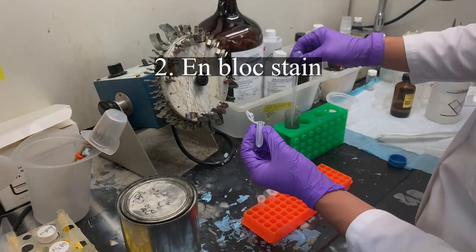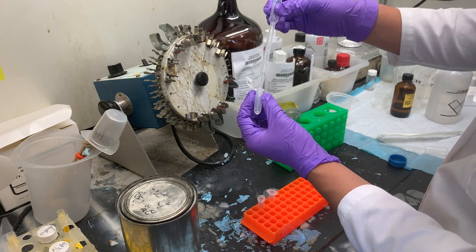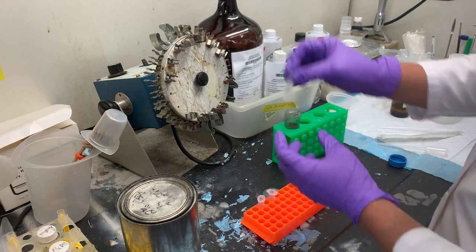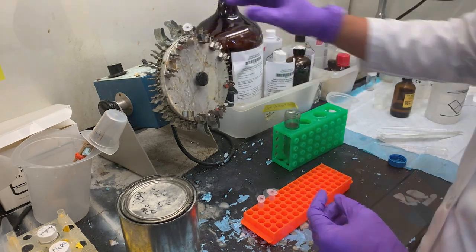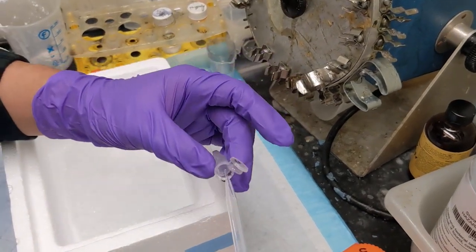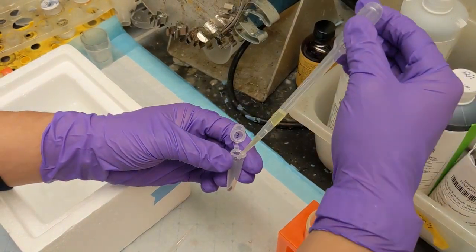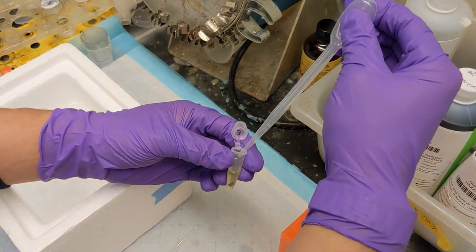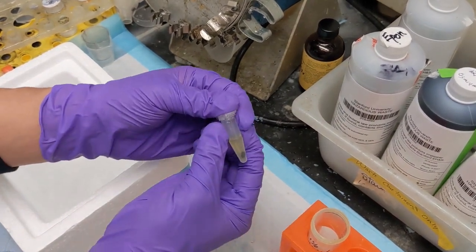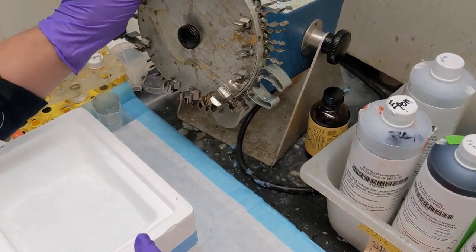With our region of interest isolated, we will apply the heavy metal stain, osmium tetroxide, which will bind electron-dense atoms to lipids in membranous structures and vesicles. The block turns black and brittle as the osmium tetroxide is reduced as it penetrates the tissue. Uranyl acetate is then used as a second stain to enhance contrast to osmium tetroxide. It additionally preferentially increases the heavy metal density of some subcellular structures, such as DNA.